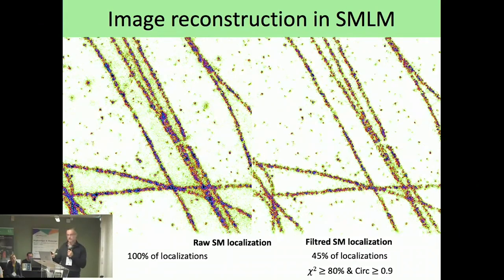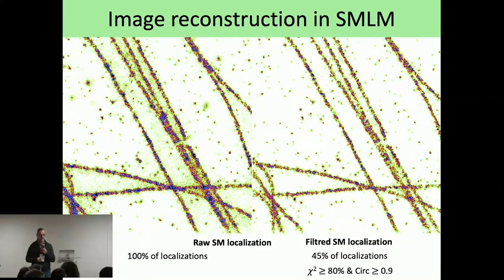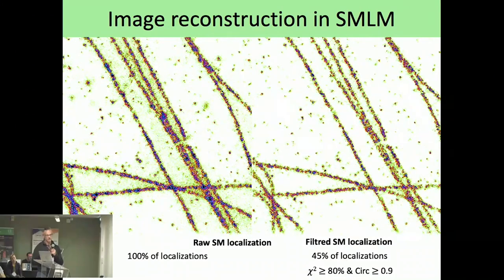Of course, it poses the problem of quantification behind. I'm not saying that it has to be done all the time, but still, there is already an error. It's easy on a template, you know, but of course much more complicated when you don't know the structure which is behind. I just wanted to highlight this because this is a real problem.